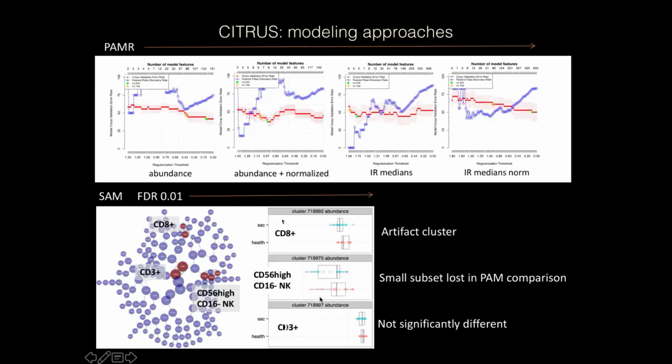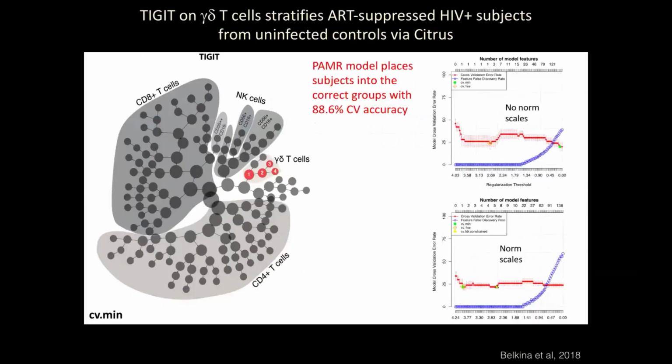When we lowered the limit enough to get that population in, there was so much overclustering that PAM didn't find it significant and interesting enough. So we took this population and followed it up with other methods to check if there's a real biological phenomenon behind this result.